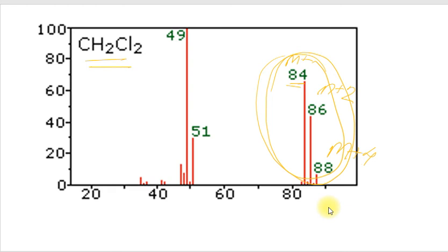What type of dichloro compound it is and how long the alkyl chain is, you have to find out by calculation. You subtract from the molecular ion peak the fragment which is lost when you consider the base peak, or the other peaks shown in the mass spectrum.